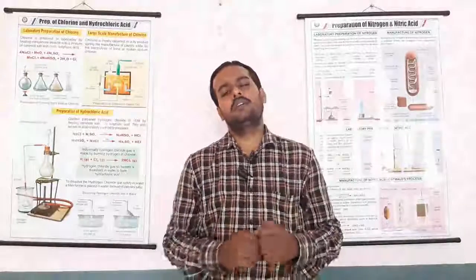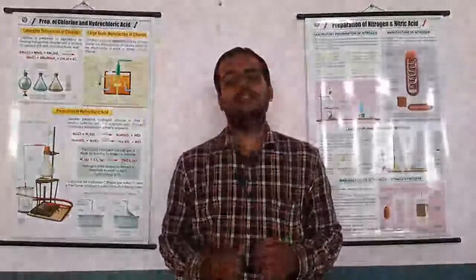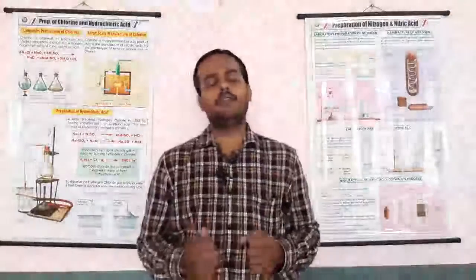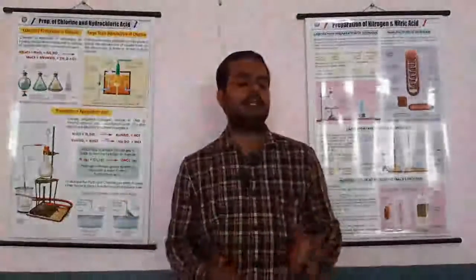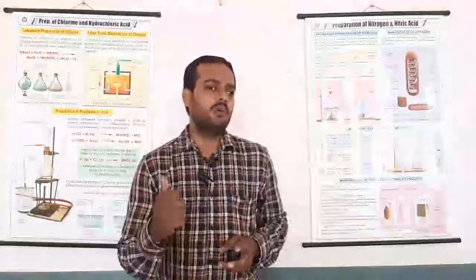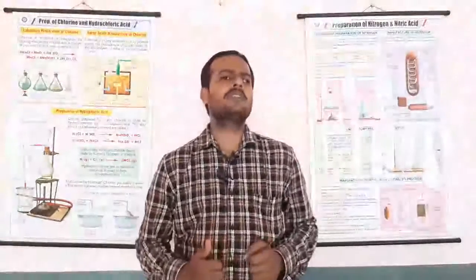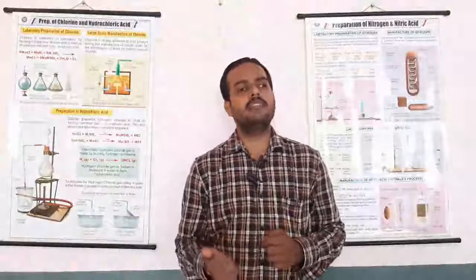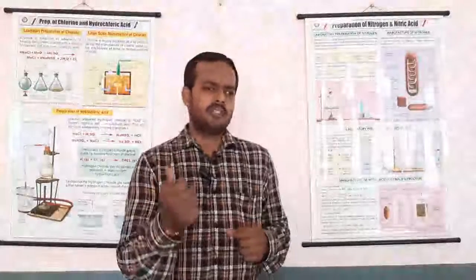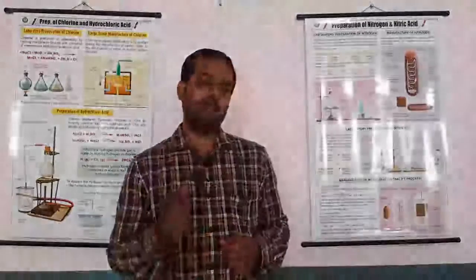So, these are the tests which show you whether a substance is acidic or basic. On the other hand, when a base reacts with sodium carbonate and sodium bicarbonate, no reaction will be given. So, a base only gives the litmus test here. However, some metals like aluminum and zinc may react with bases, but the reaction rate will be much slower compared to when acid reacts with zinc metal.